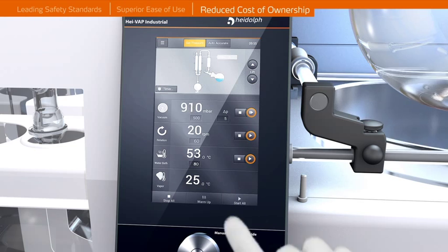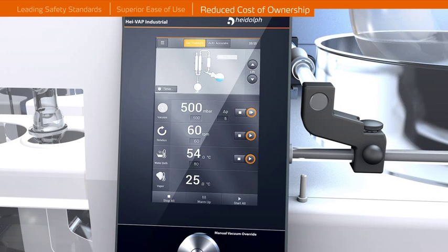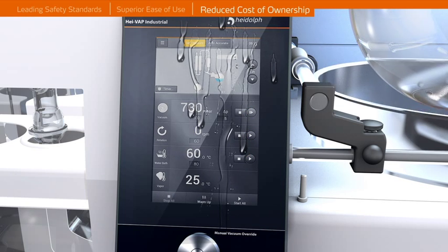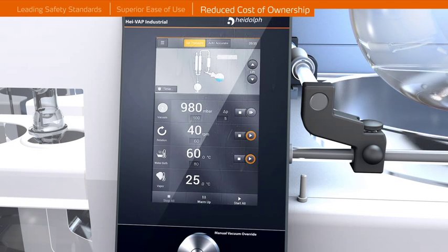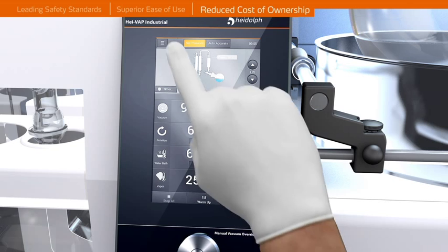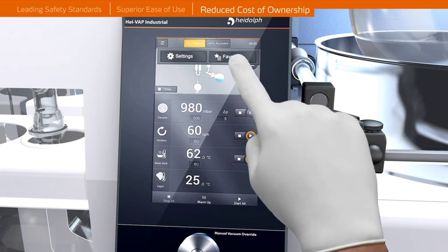Reduced Cost of Ownership. A touch screen panel provides an intuitive operation while the glass layer on the panel protects the internal electronics against liquids and corrosion. The unique user interface offers a number of intuitive features like a preheating option for the heating bath to ensure an efficient workflow.